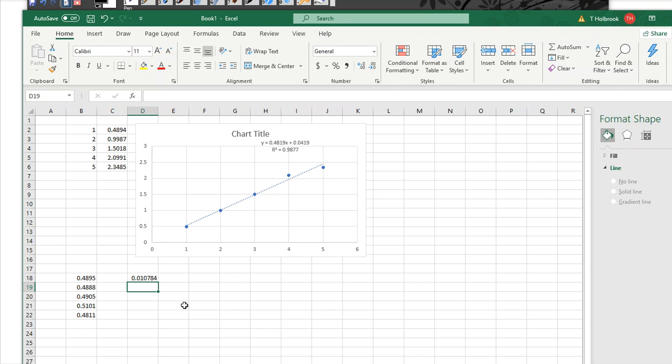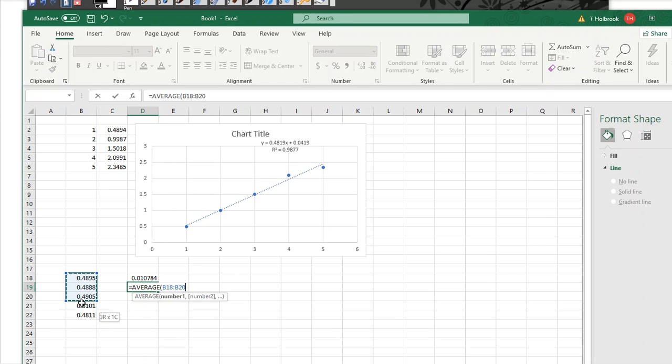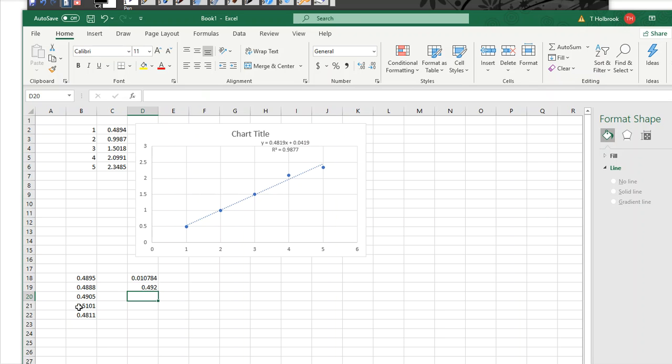At any point in time, if you have to do average, I'll give you another key. Start off with equal. There you go. Type in the word average. Open your parentheses. What do you want the average of? Highlight the data. Cap it off with the other parentheses. And then hit enter. There you go. It's even calculated the average for you automatically as well.